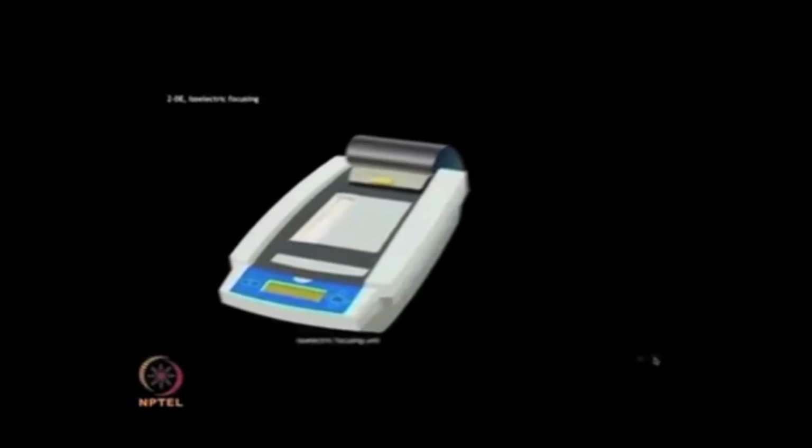The protein sample being applied, a very low voltage condition is provided and then cover fluid can be added. This is then placed in the isoelectric focusing instrument and low voltage is applied. The process can be performed for 10 to 20 hours.